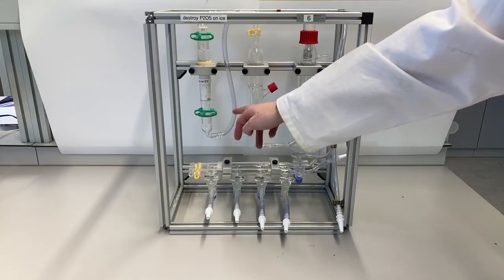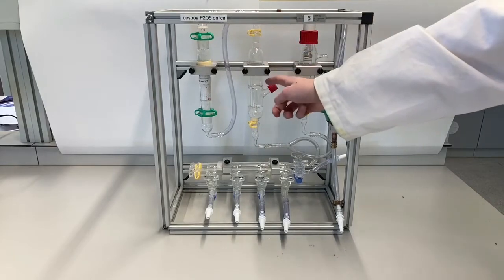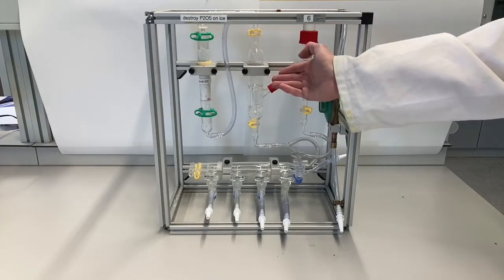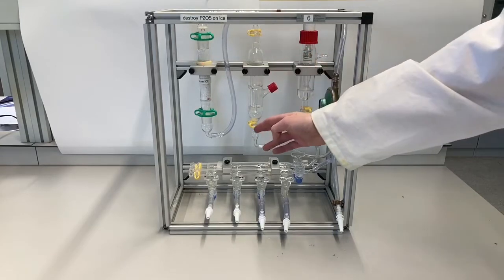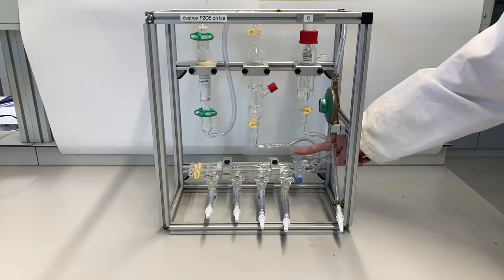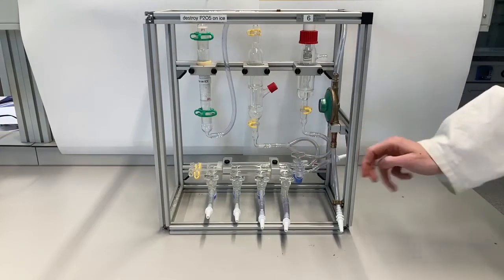After that it will go through this line into this bubble counter, where you will see bubbles forming, proving that there is actually gas flow through the system. At the bottom it connects to this double manifold, which you can connect to your reaction.